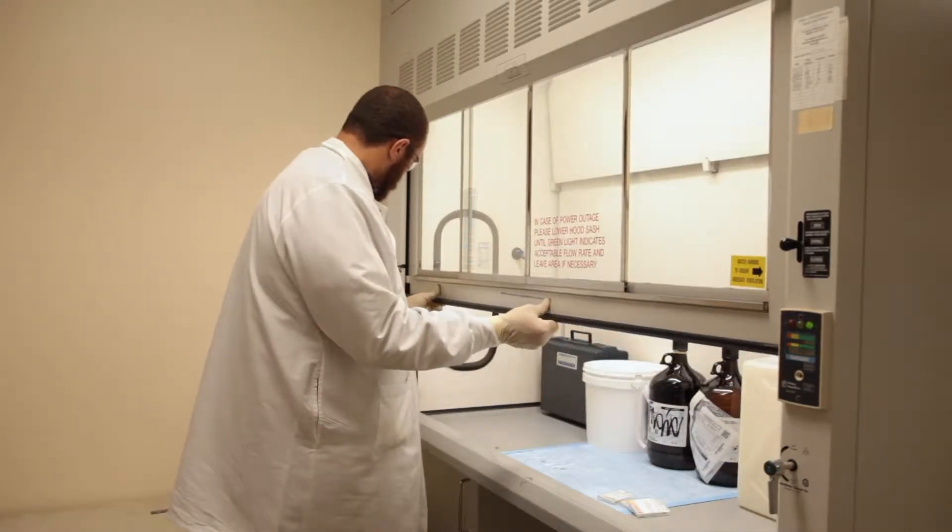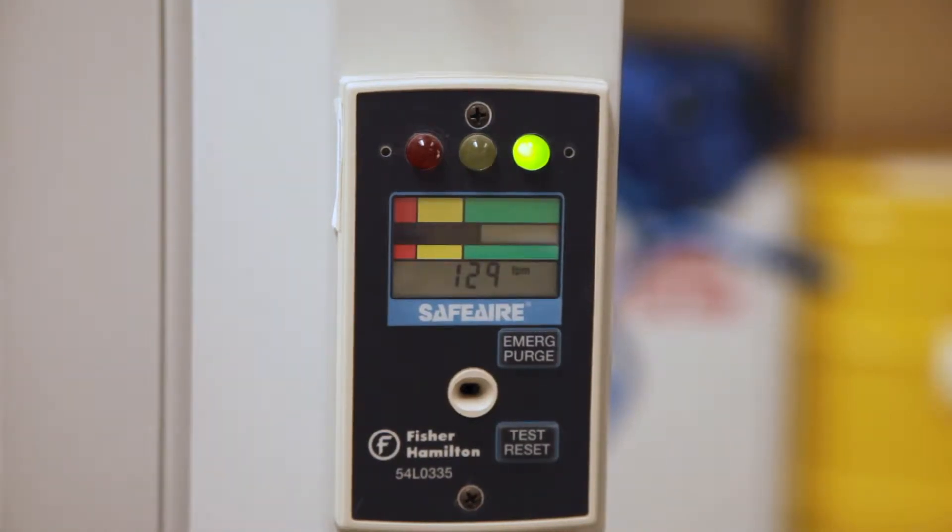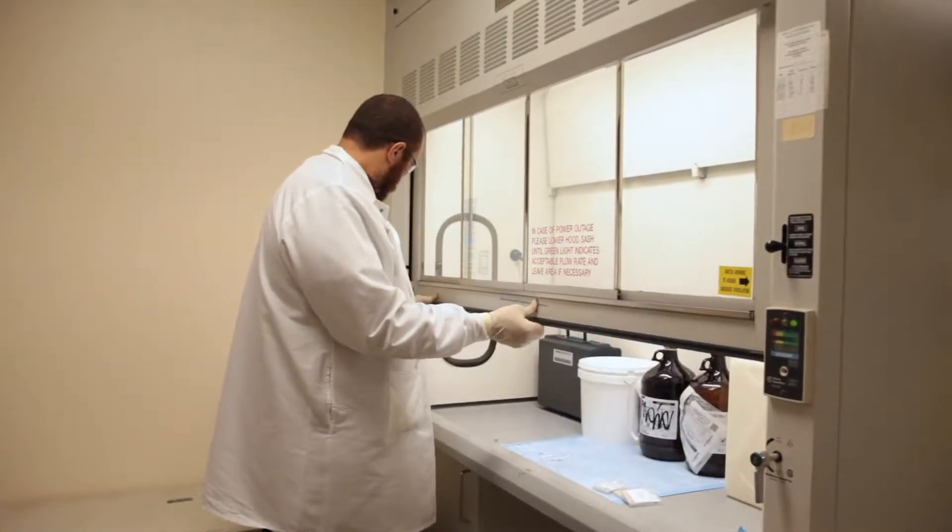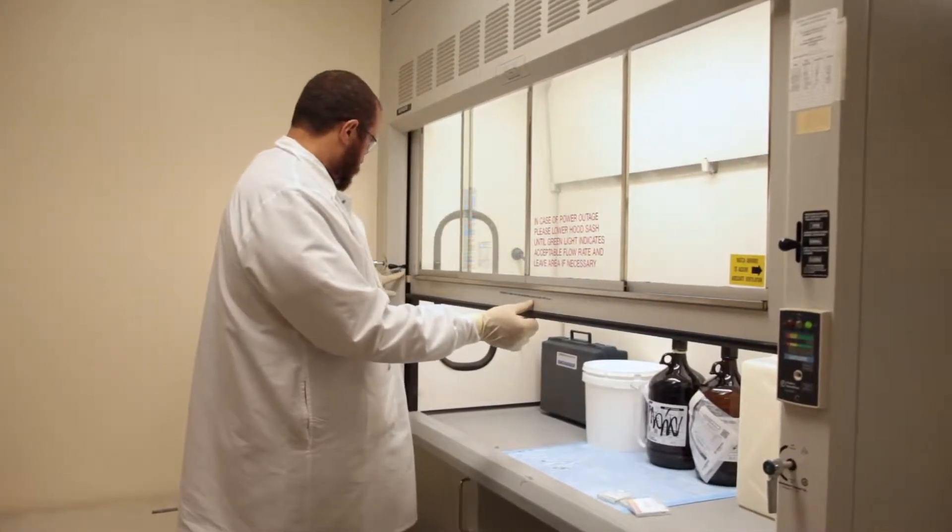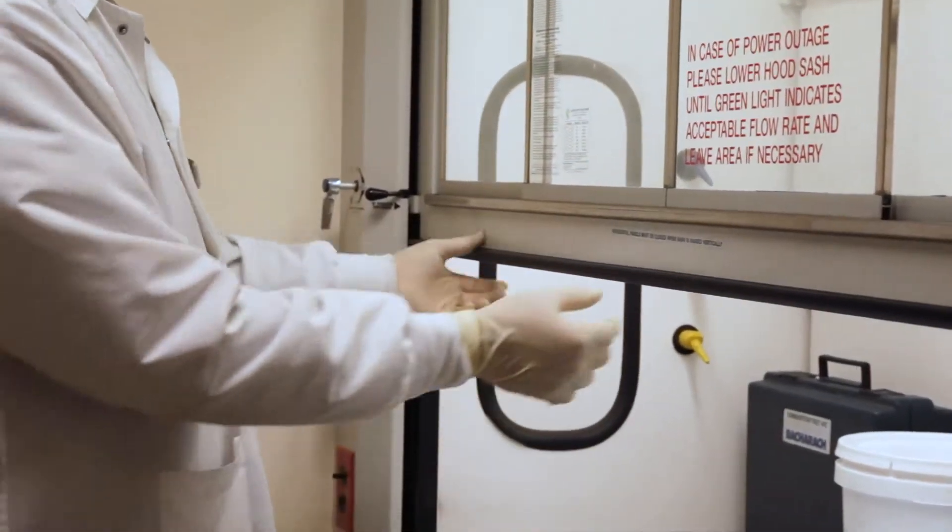Most fume hoods operate at a constant airflow. As a user opens or closes the sash with these types of hoods, the face velocity changes. The proper working height of the sash will be noted on the front of the hood. When using a fume hood, ensure the sash is not raised above this position to allow for proper airflow.